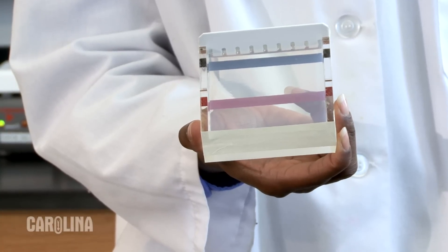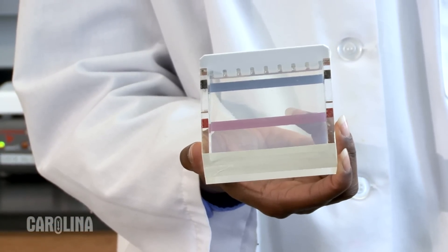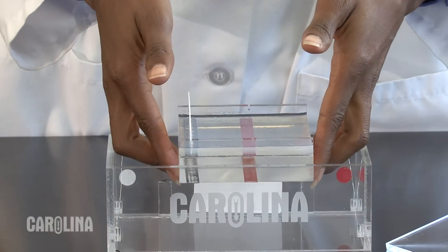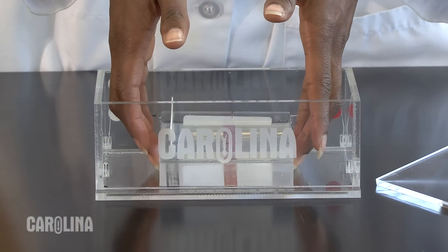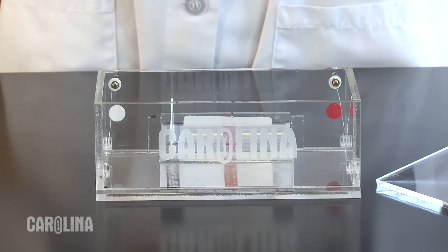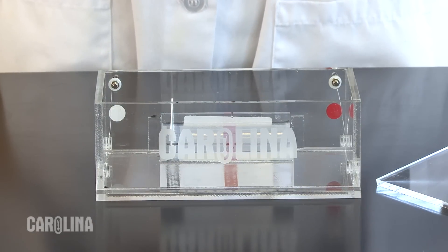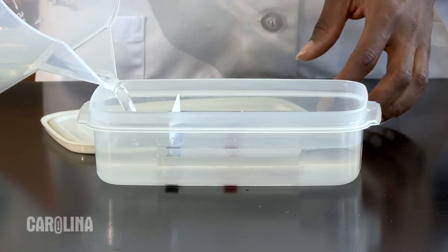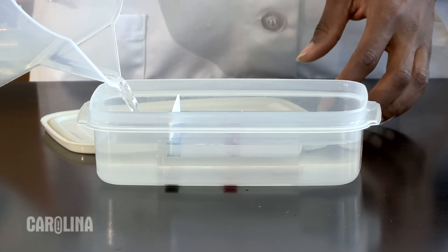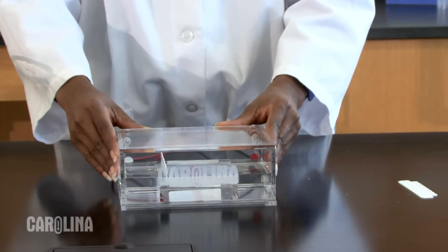It will take about 15 to 20 minutes for the gel to set. Once it is set, the gel will look cloudy. At this point, the gel can be placed in the gel chamber in preparation for loading. One final point: as long as they are not poured with stain in them, gels can be poured several days ahead of time. To keep them from drying out, store the gels covered with buffer in a sealable plastic container or in the electrophoresis chamber with the lid on.